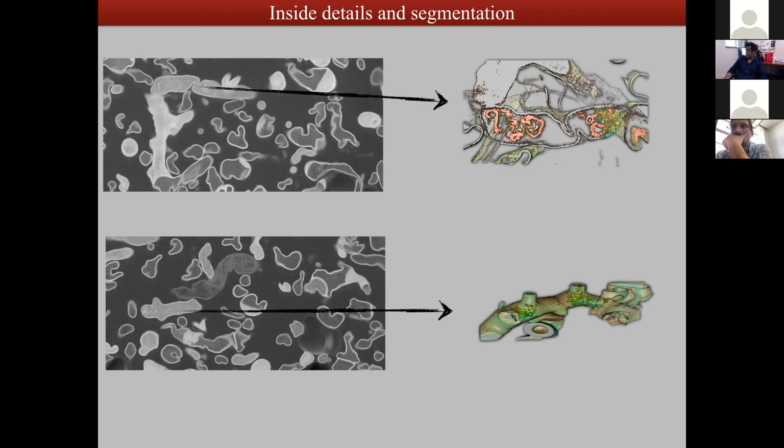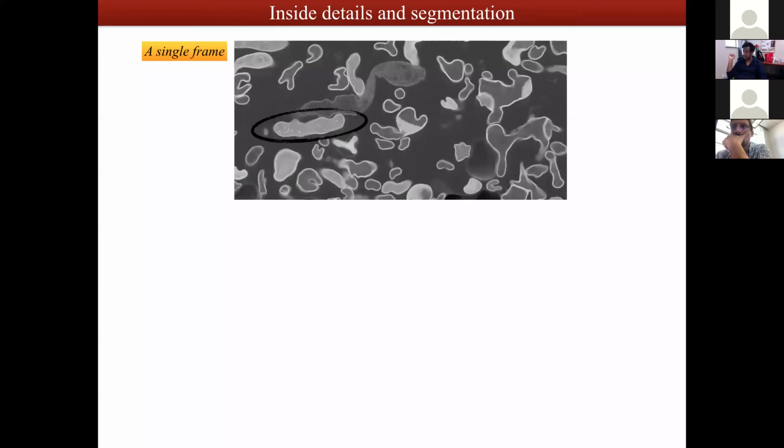Now, that is good, but one will always ask the question: these are filamentous bacteria, and my sample extends to, say, about 300 microns. How am I going to do it? Well, from the stack of images, you can generate the reconstruction, and then you can extract out the whole filament from that electron density map using computational analysis. And we have the software, Amira and Avizo, with us, and so you can use that to trace out the whole path of the filament. So let me show you an example of that.